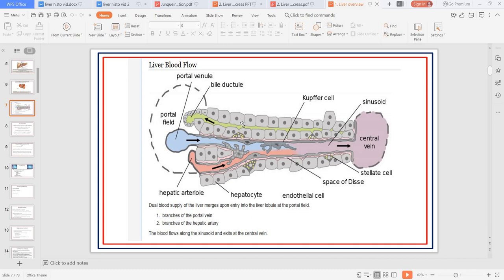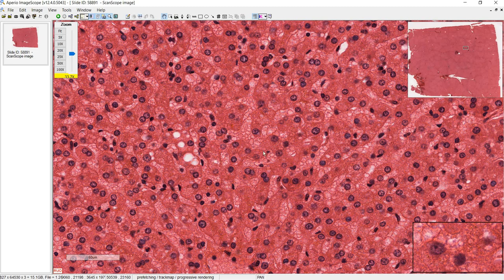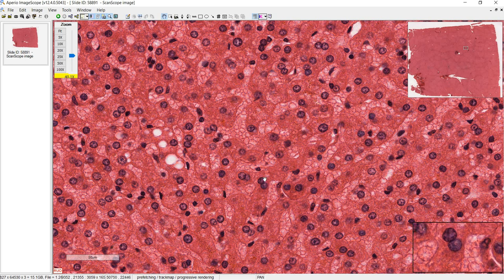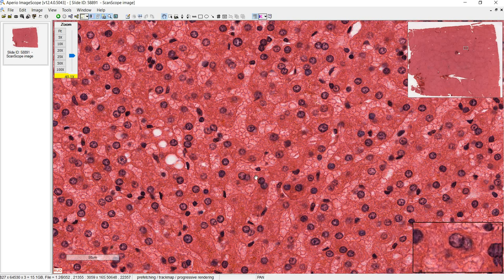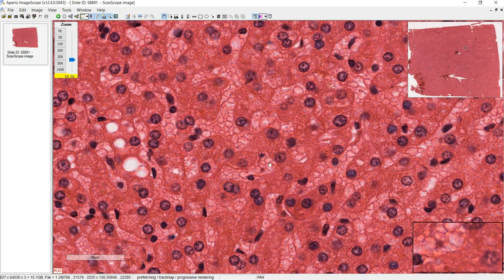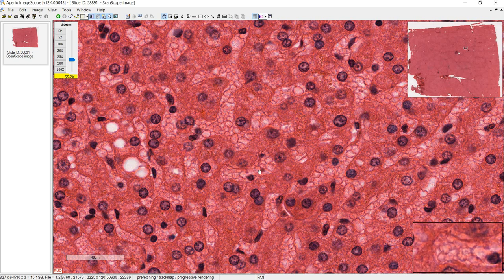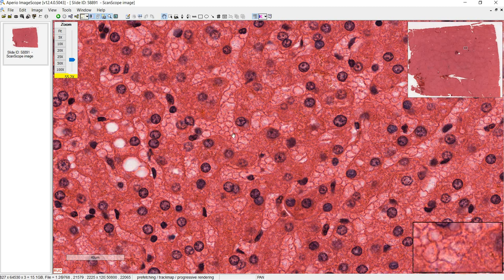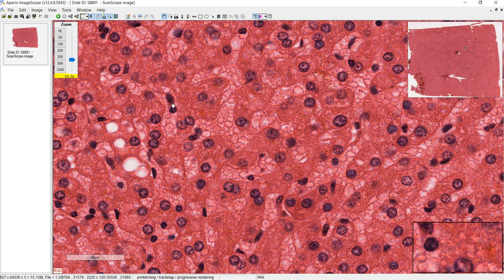This is a picture from the first lecture in the liver overview — these are all hepatocytes, arranged in hepatic plates or cords, usually one or two cells thick. Some of them have two nuclei. There's a lot of cytoplasm in them, and in between the plates or cords you have the sinusoids. So hepatocytes and sinusoids are basically alternating with each other.